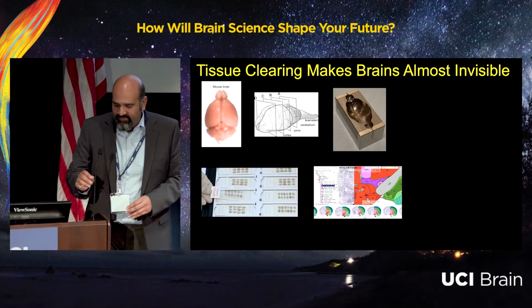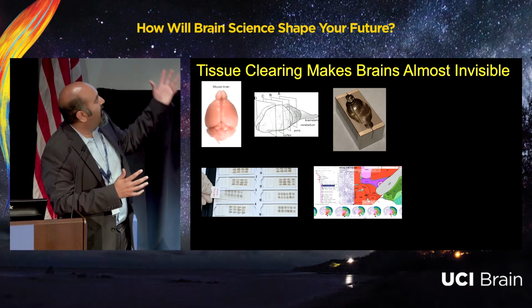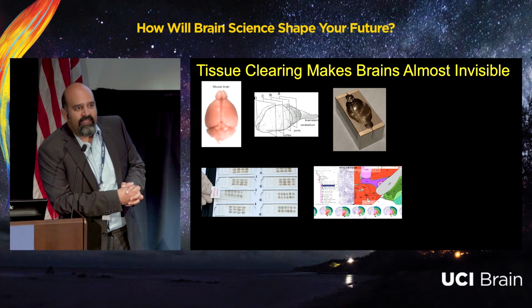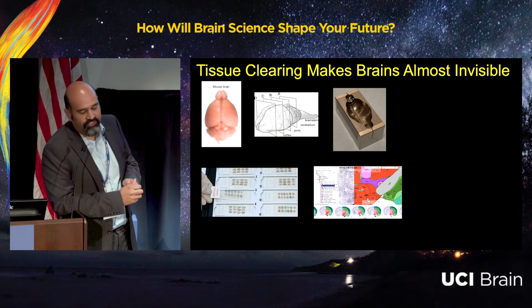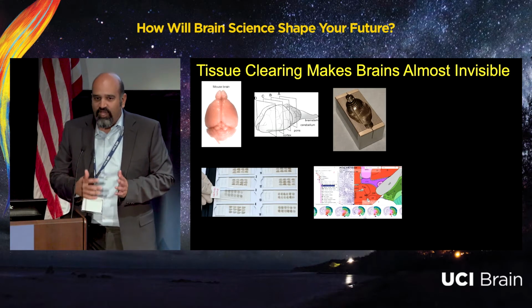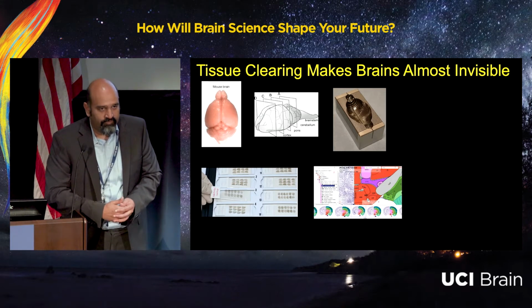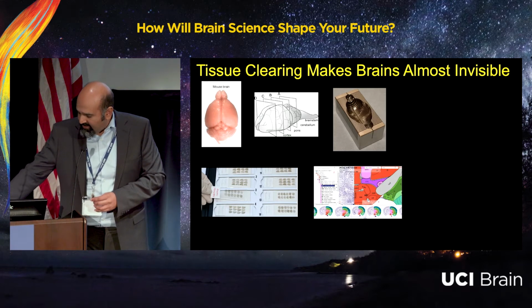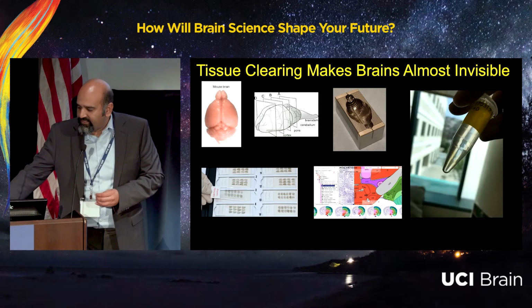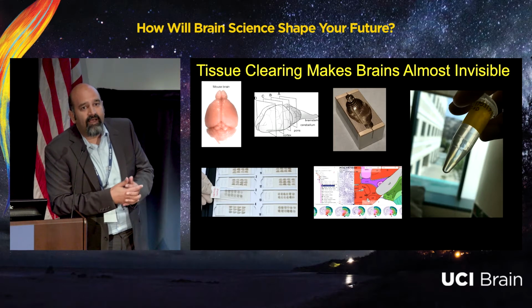brain. We want to understand the brain and its mysteries, but unfortunately, in many ways, the brain is opaque. It's quite literally opaque as a piece of tissue, and to look at its cellular organization, for hundreds of years, we've resorted to chopping up the brain into thin sections and laying it out on slides so that we can look into it with a microscope. But in the last 5 years or so, new technology has emerged that allows us to hold the brain together and keep it intact while making it optically transparent.